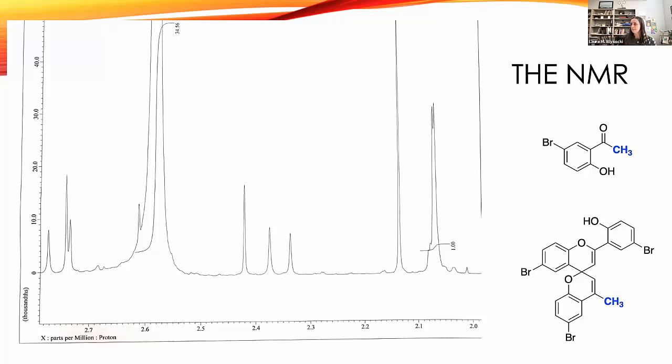yield. So for students who are doing research and those who use NMR frequently, this is a really clear outcome, right? Of course, you could use NMR to see how much you have, but for students who are going through the curriculum and are used to seeing in a book a pure NMR sample, this is something that challenges them and that they have to work through and think about what this actually means.